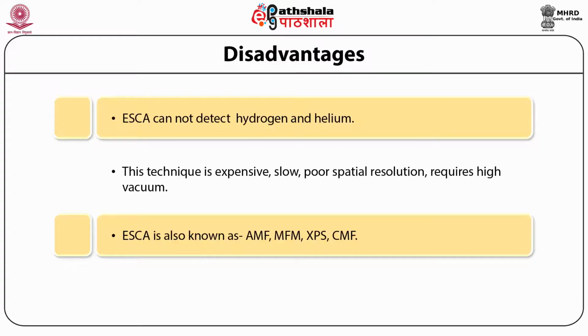So if hydrogen cannot be assessed, then the analysis remains incomplete. We have to do this analysis by indirect means: whatever is the percentage of all other elements on the surface, we calculate those, and then by subtracting those from 100, we can get an estimate of how much hydrogen is going to be there. Similarly, an estimate about helium is carried out.